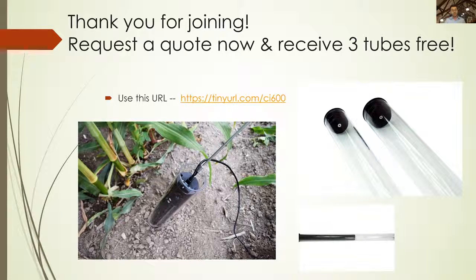The next question is, can we still have the option of Minirhizotron software besides the RootSnap? And the answer is yes. These scans are all being saved in a couple of different methods, both with the data alongside as well as just a simple image. You can take the simple image and put it in Minirhizotron or any other software you'd like.